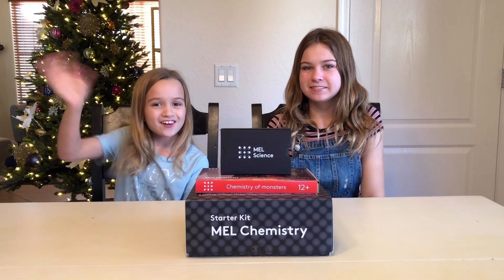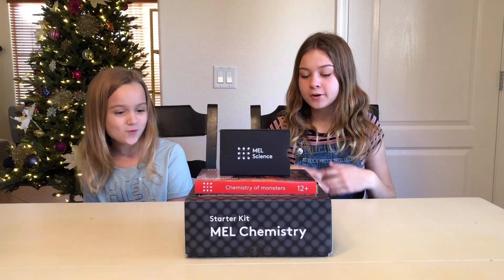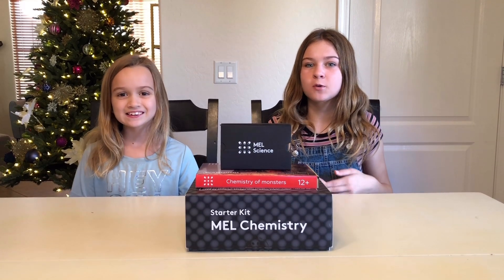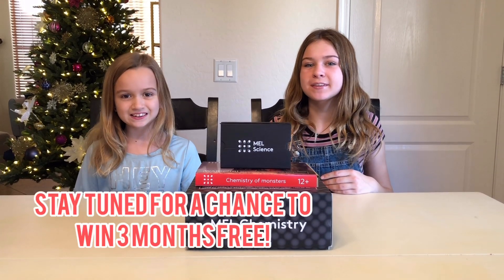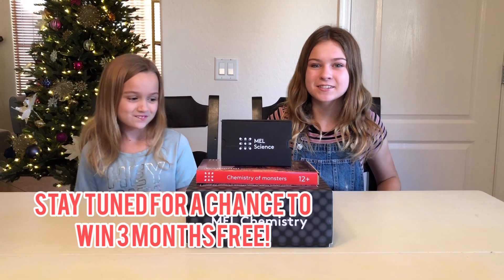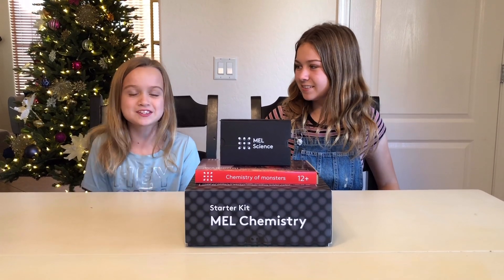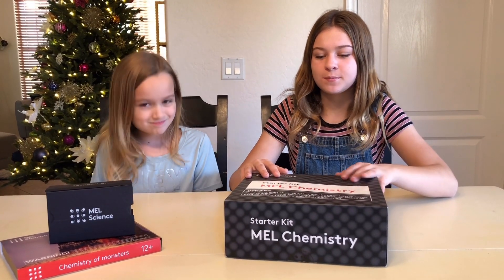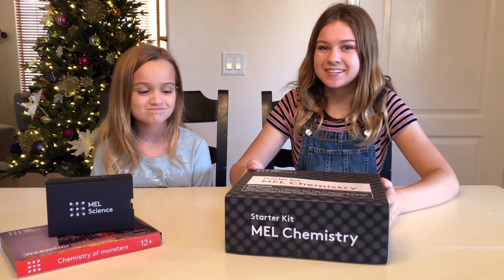Hi guys, it's Lily and Chloe, and today we're doing something we've never done before. We're partnering with Mel Chemistry, which is a monthly subscription box that sends you science experiments and cool things to do every month. We're really excited to get started. So with your subscription, this is the starter kit that you'll get in the first month.